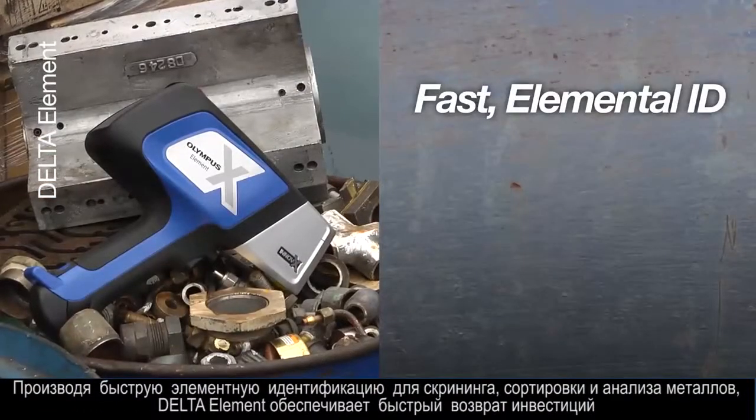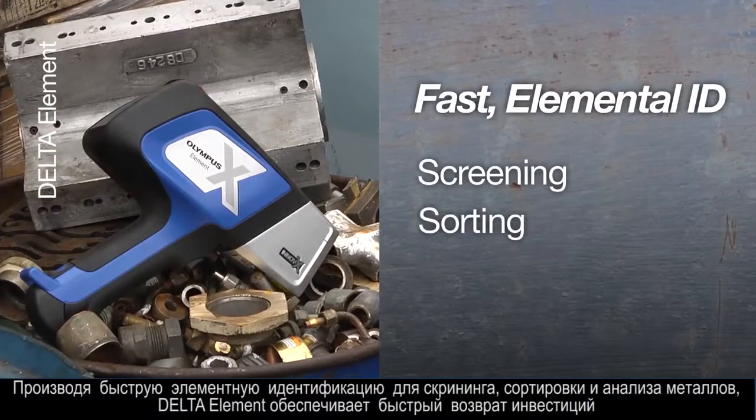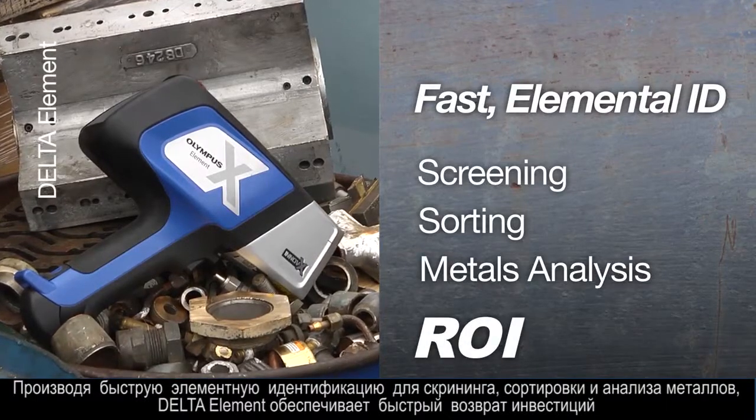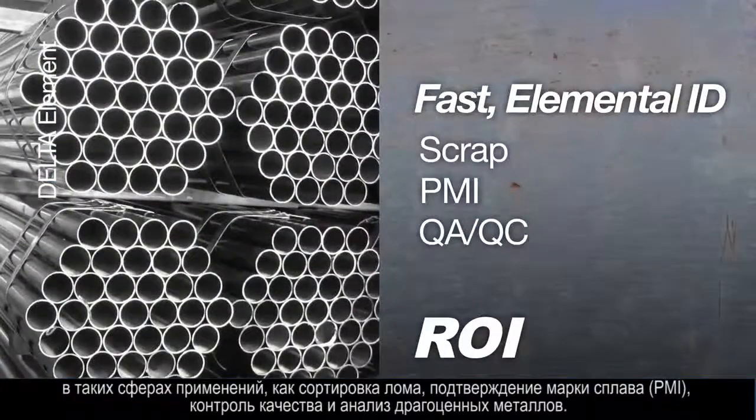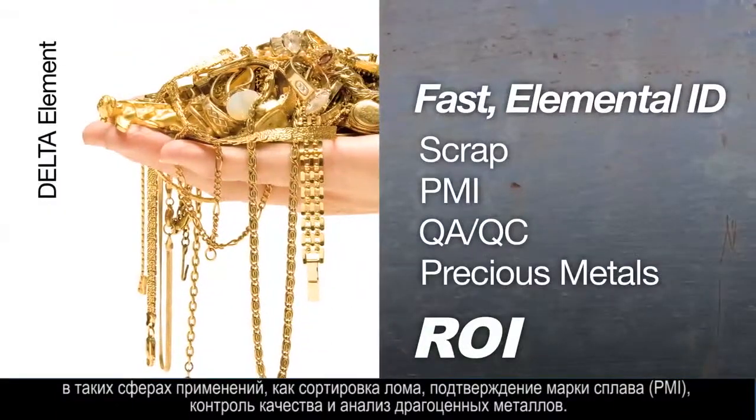With fast elemental ID for screening, sorting, and metals analysis, the Element provides a quick return on investment for scrap, PMI, QAQC, and precious metals applications.